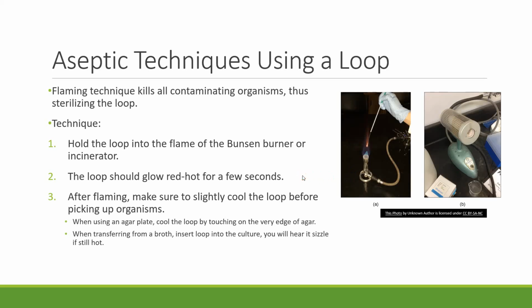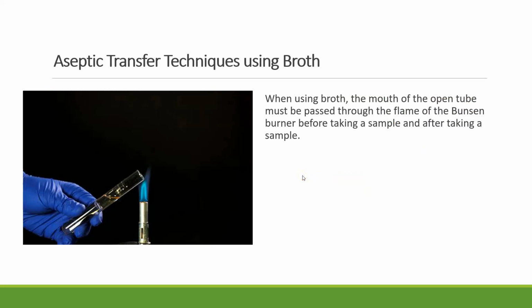The other thing that you have to be careful of when you're dealing with aseptic techniques and you're transferring, many times if you were in the wet lab, you would be starting with a liquid broth in a test tube. So when you're talking about maintaining aseptic techniques so that the liquid in here is not contaminated, so it maintains that pure culture, you will run the open test tube over the flame a few times like this in order to heat up the air in there and the air around it to kill any contaminants.